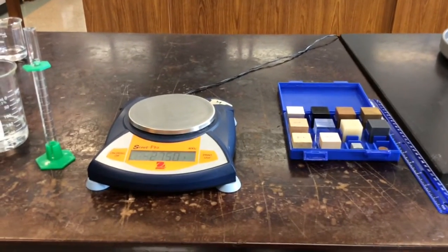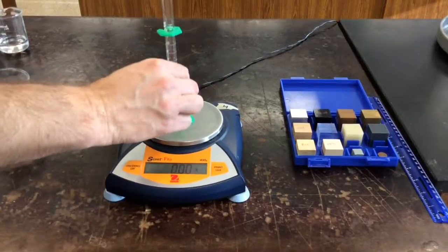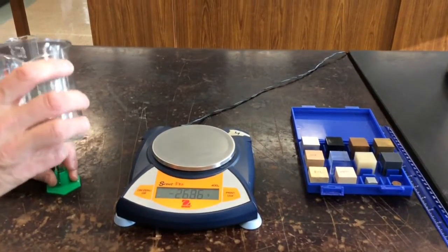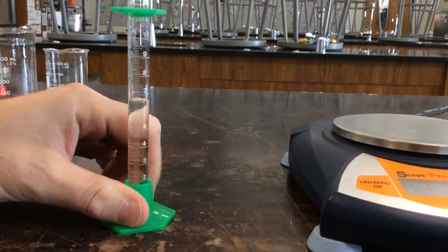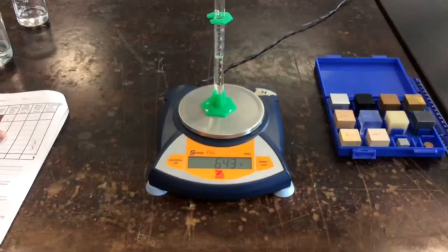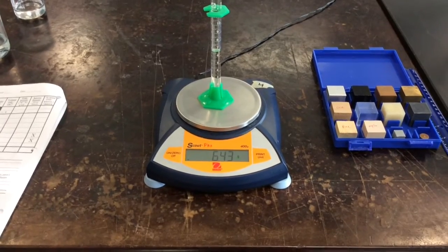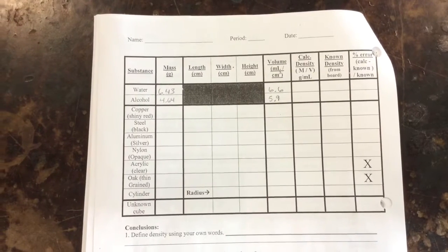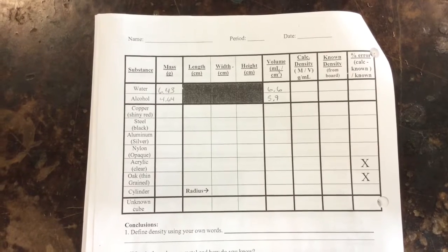In order to measure the density of the second fluid, which is going to be water, you're going to again have to re-zero your balance. The second graduated cylinder on the balance, hit re-zero. You will also get between 5 and 10 milliliters of the water. In this case, we've gotten 6.6 milliliters of water. Place the graduated cylinder back on the balance. For the 6.6 milliliters of water, we've got a mass of 6.43 grams. With this information, you're going to calculate the density of both liquids. So you'll take the mass divided by the volume.